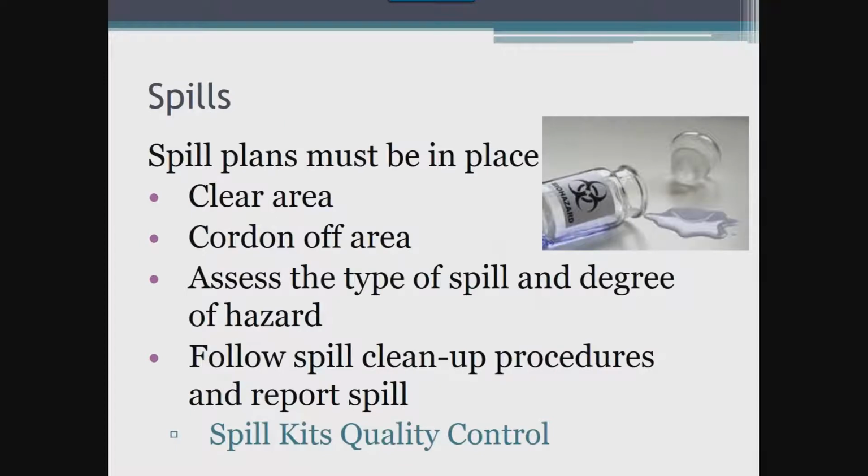In addition to staff being educated on steps to take in the event of an exposure, they must also be prepared to handle spills. Managing spills is important no matter whether the spill is minor or major. Every facility that uses chemicals must have a plan in place listing out the steps to take in the event of a spill. Labs that are part of larger organizations often have hospital policies and procedures that drive the majority of the process, and then the lab plans can be piggybacked onto these processes.